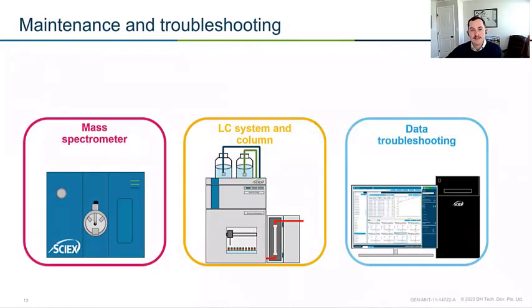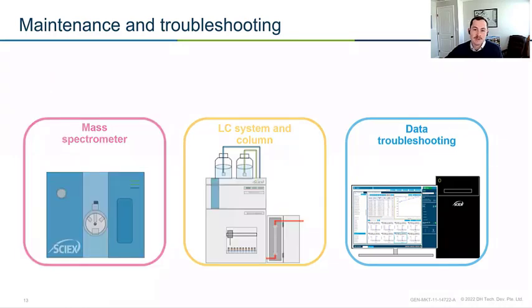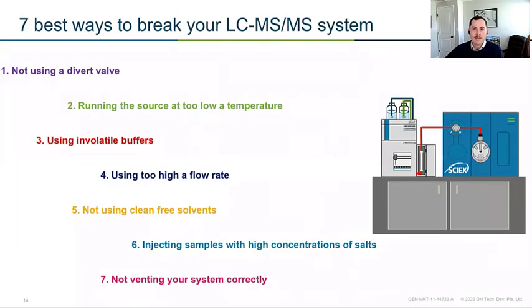All right, so let's get into some of the fun things. We've got some examples of some issues. I took a second and thought about some of the most efficient ways you can break your mass spectrometer. After all the years on the tech support team and dealing with customers, I've seen some pretty creative ways. I've done some pretty creative things. So here's my list of the top 7 ways to break your mass spec.